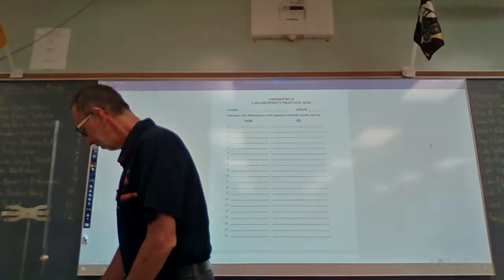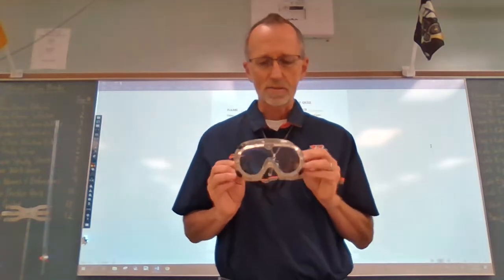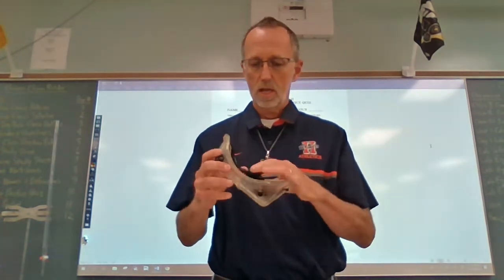Number two. I think we all know what these are. Of course, these are safety goggles or just goggles, and these are used for eye protection. They protect the eyes when heating or working with chemicals.